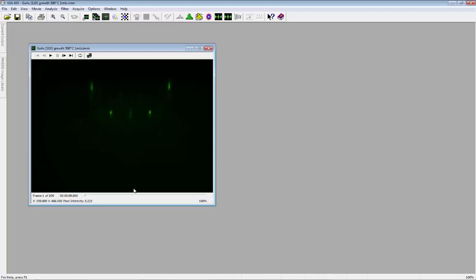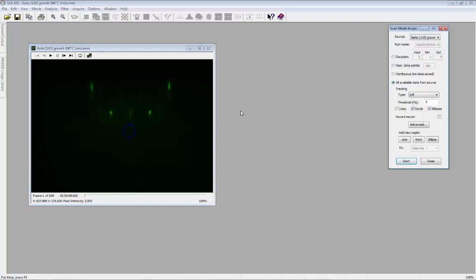Select Scan Mode from the Acquire menu or use the icon in the toolbar. Select the desired source. In this case, I will select all available data from the source, but I could also choose a specific time duration. Adjust the region of interest to correspond to the first order spot. Add a new region and adjust it to correspond to the other first order spot.